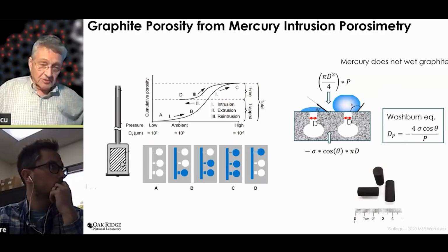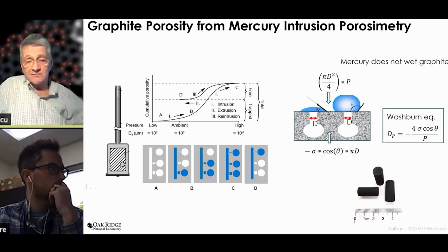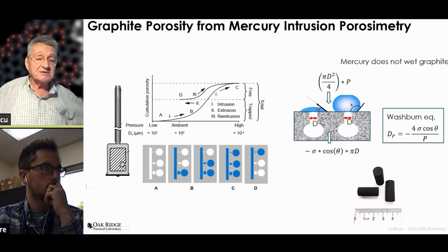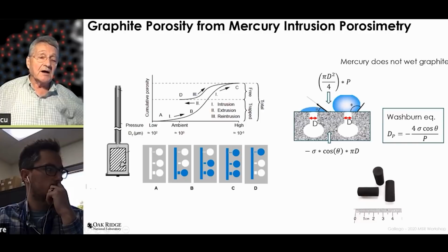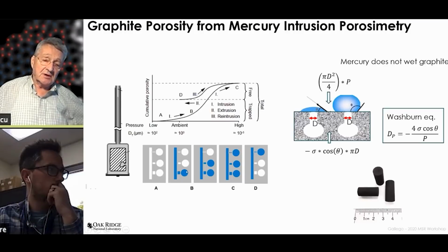some of the graphites. We use mercury porosimetry to explore the porous structure of various graphites. Mercury porosimetry is based on a very simple principle. You take the specimens machined in this shape like cylinders, and they are placed in this penetrometer, which is sealed, and then it is flooded with mercury, which does not wet graphite, and after that it's pressurized from outside. So what happens when we increase the pressure, initially the pores are not filled, and then applying pressure higher and higher, pores become filled, starting with the pores with a larger throat at low pressures and gradually going to pores with very narrow throat at highest pressure.